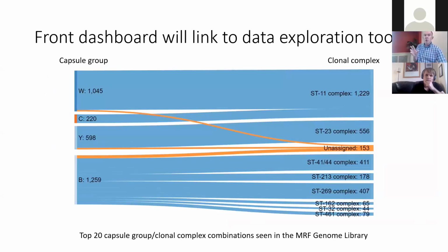Because of the requirement to update the dashboard quickly on the front end, those front end elements are limited, as I said, to breaking down single fields, partly because they need to be updated quickly. Generally, we want all the elements on the dashboard to be available within about a second of loading the page. But also we don't want to put a big load on the database server. Every time somebody goes to the front page of the database, we don't want a massive spike of processing that's required to populate the dashboard. So we limit the front end just to single fields.